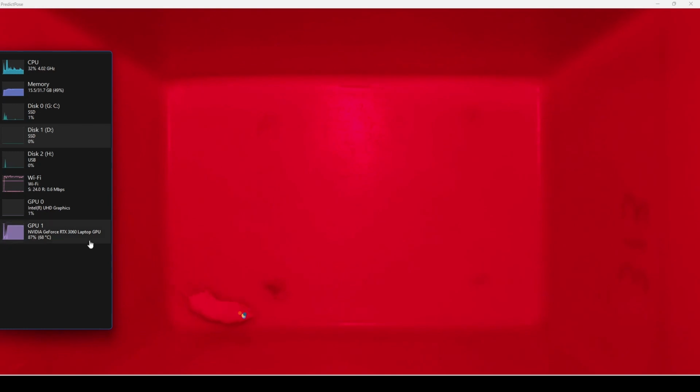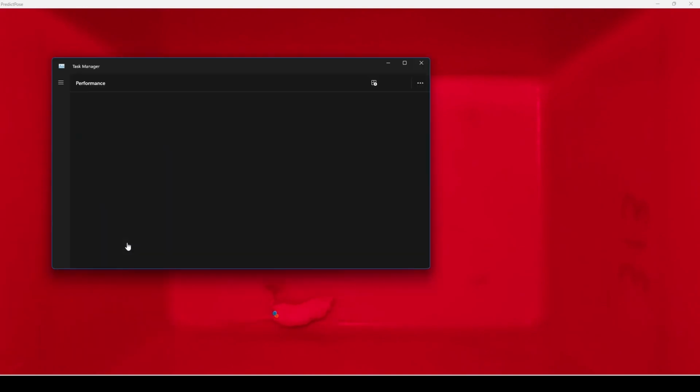Okay, so I just wanted to make a quick video to showcase how you can get started with DeepLabCut, train a model, export it, and how to utilize it with Bonsai.